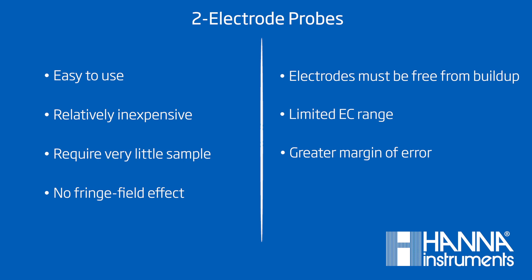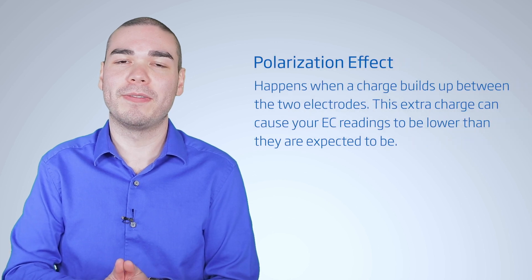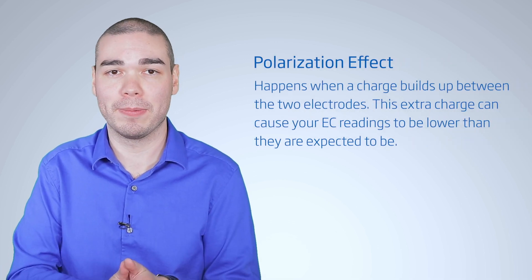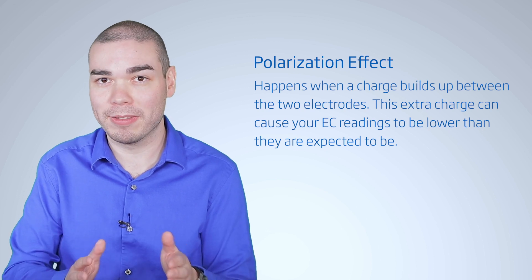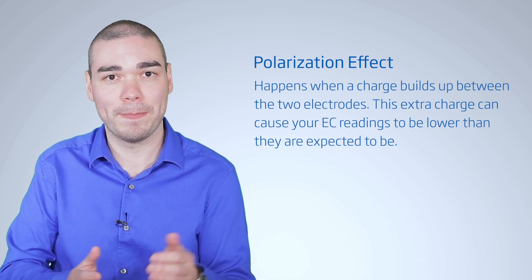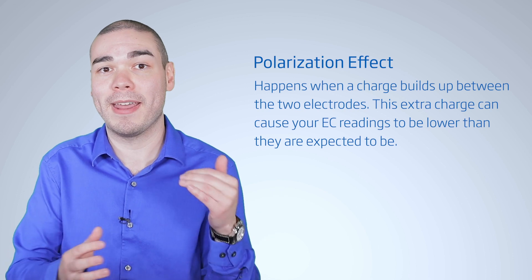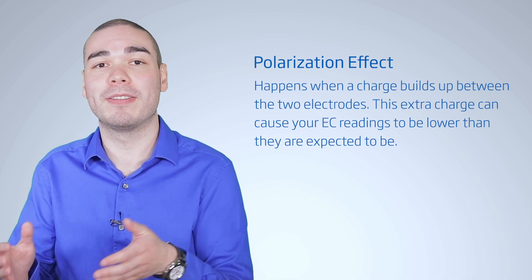Something to be aware of with two-electrode probes are that the space between the two electrodes has to be stable. If the electrodes get bent, or if a residue builds up, you will get inaccurate readings. Each probe only covers a limited EC range, so if you're testing low-range and high-range samples, you will need to buy multiple probes and/or meters. The last thing to note on two-electrode probes is something called polarization effect. The polarization effect happens when the charge builds up between the two electrodes. This extra charge can cause your EC readings to be lower than they are expected to be. This can be minimized by two-electrode probes that have their electrodes made out of graphite instead of stainless steel.